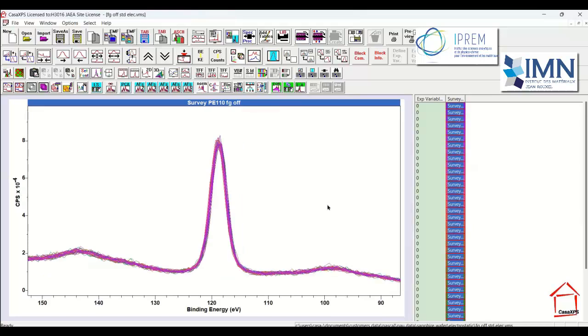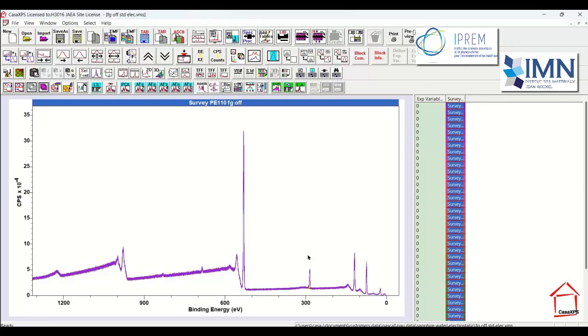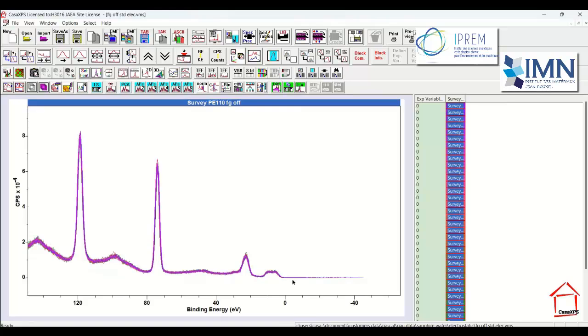That, when we had good charge compensation, was coming out at 118.9. So what do we have now? We have 118.9. So the calibration for this electrostatic mode with the charge compensation off seems to have produced a reasonable calibration, and as you can see, the fact that we didn't have such a big shift has made a difference to the results that we're getting for these peaks.